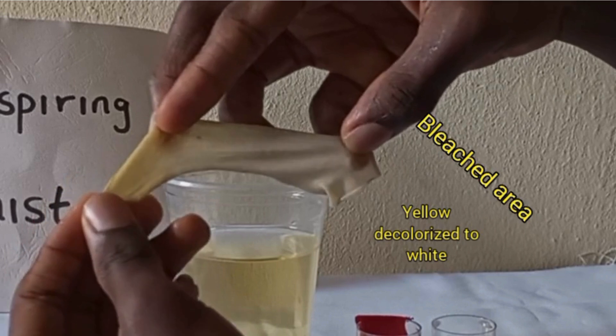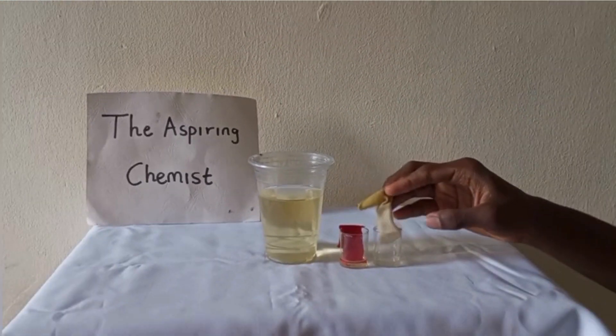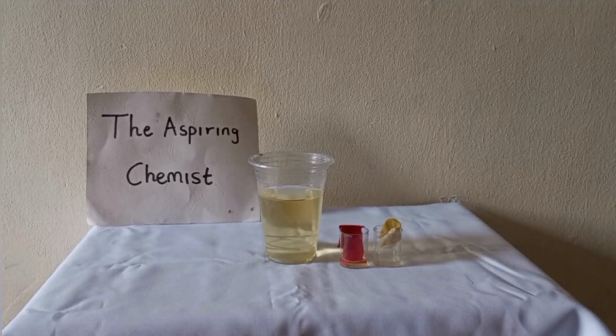That means the experiment is a success. Now what I want to do is store our bleach for household use.